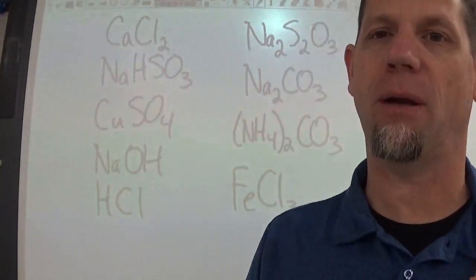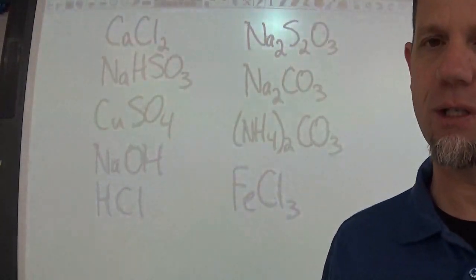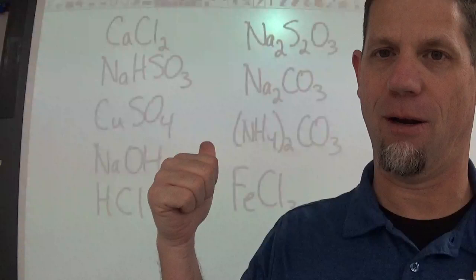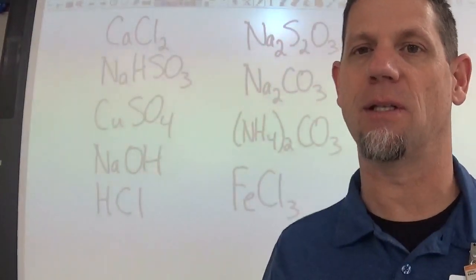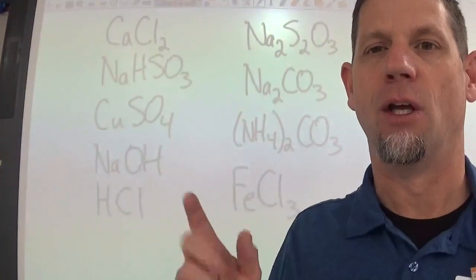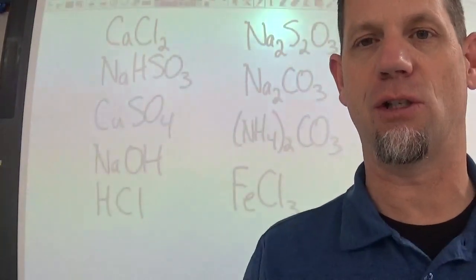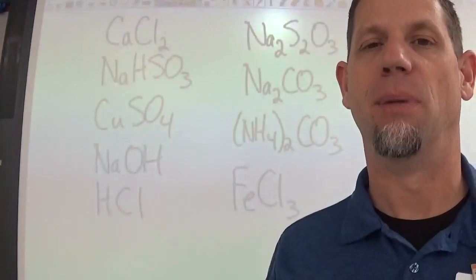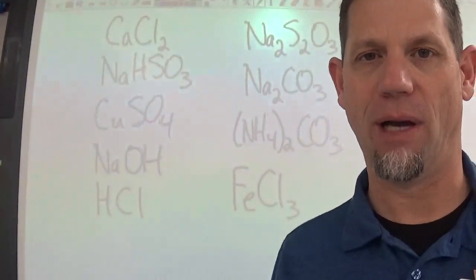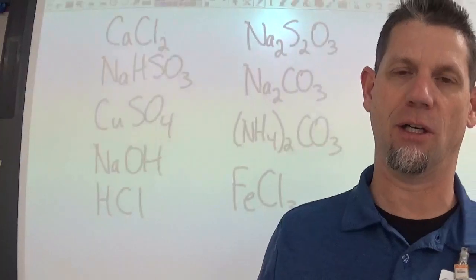9 chemicals, dropping them in. Do you know the driving forces? There are 4 driving forces. You had them written down a minute ago. Make sure you know those driving forces. Then when you get done with the experiment, this is where it's going to get a little bit more difficult. You're going to need to write balanced equations for all of the reactions that took place. That's going to take some time because it's not just like 4 reactions. There are a lot of chemical reactions that are going to occur.